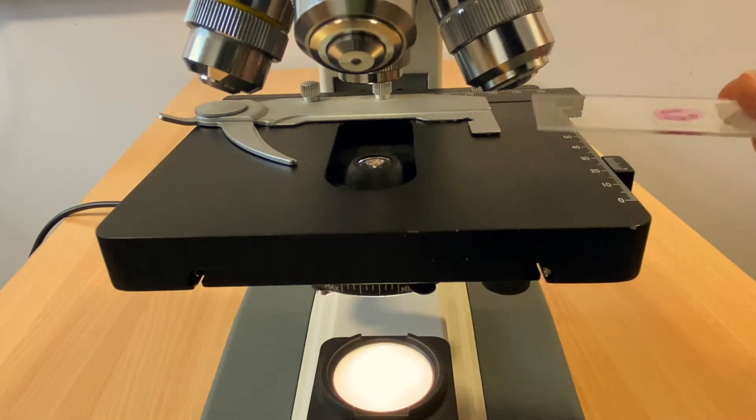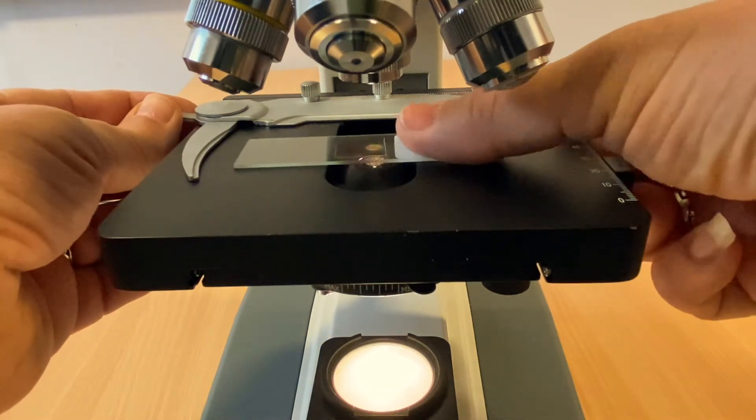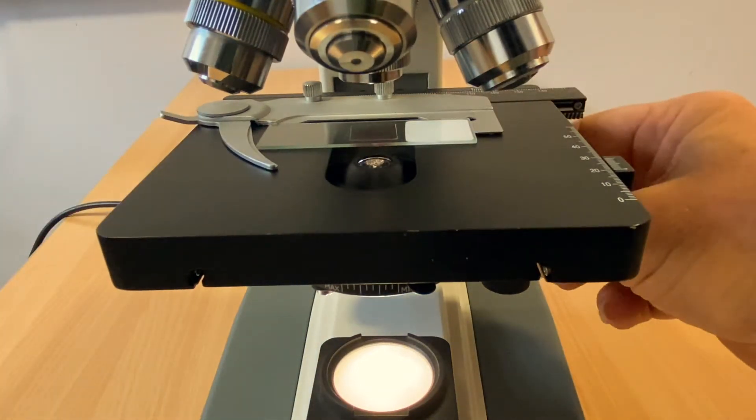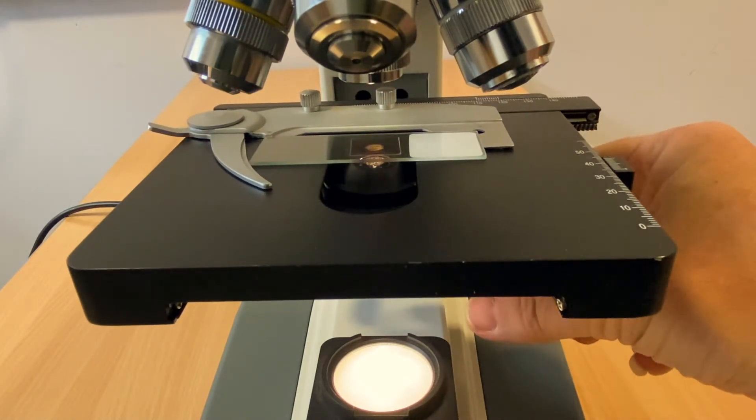Slides are secured on the stage by using the slide clip. Open the slide arm and the spring-loaded clip will close on the slide, holding it securely in position. Locate the specimen on the slide by eye rather than using the eyepiece.